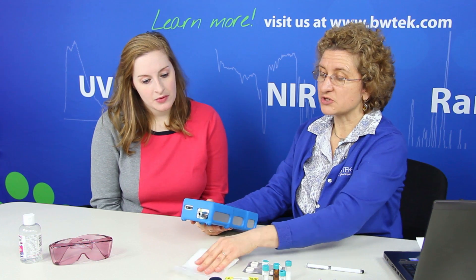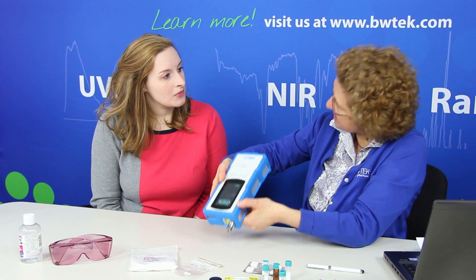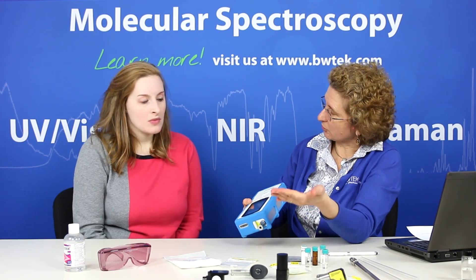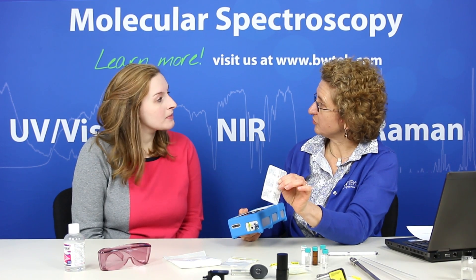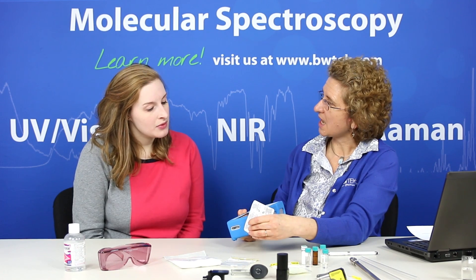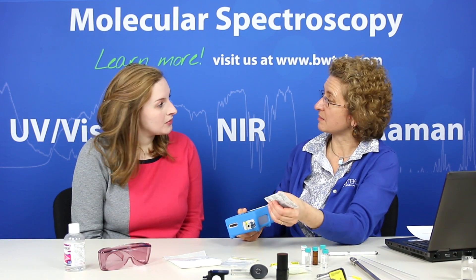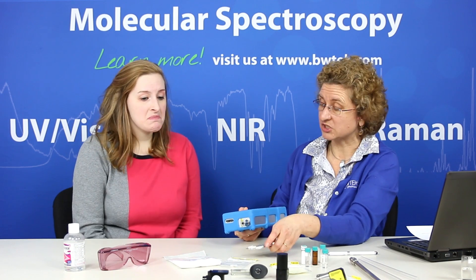The point-and-shoot allows us to measure, say, in a plastic bag, and if you went out to a loading dock you could measure through the packaging on a drum by pressing against the plastic inner packaging. We can also measure through a blister pack like this — pressing up against it — where the focus is such that we're not getting the plastic measurement but we're getting the sample that's behind it. That's what we're actually measuring.